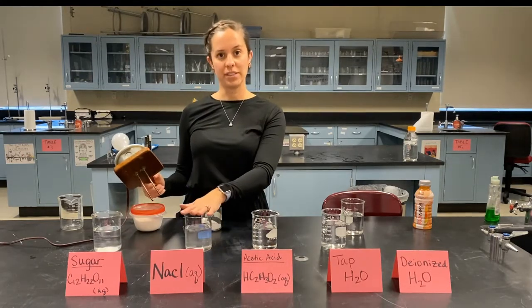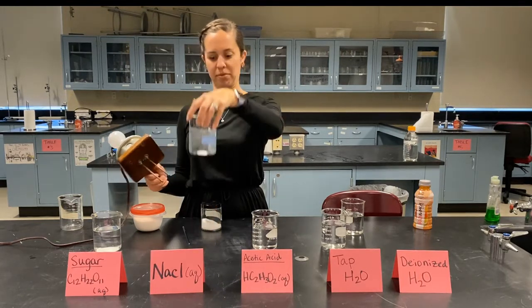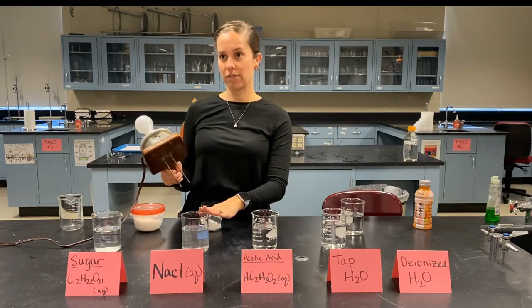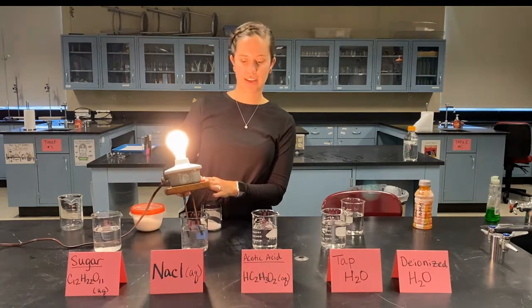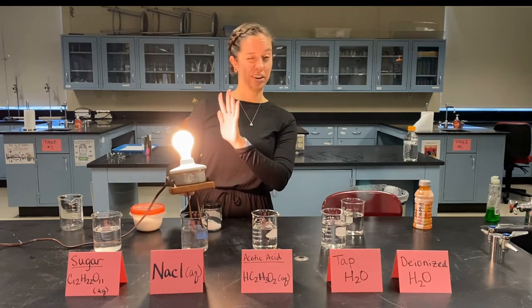Okay, so I took my salt and I dissolved that in water to give me a salt solution. You can still see some of it in the bottom of the beaker maybe. But when I dissolve that, remember, I'm expecting all of those ions to fully dissociate. I would expect a salt water solution to be filled with strong electrolytes. And notice, my light bulb is very, very bright, right? I don't want to look directly at it. I already made that mistake once.